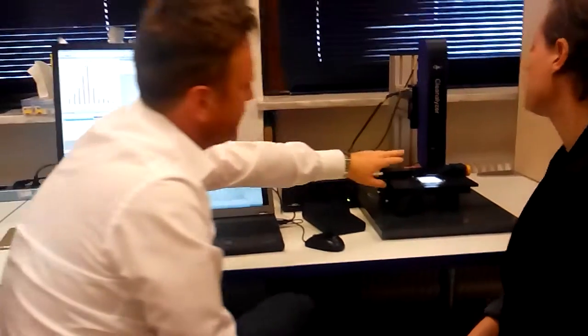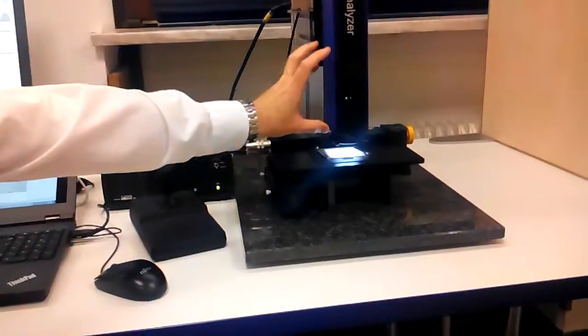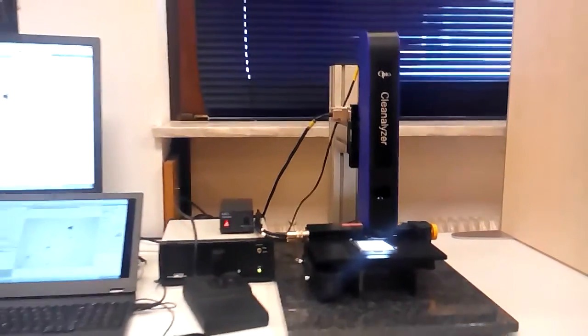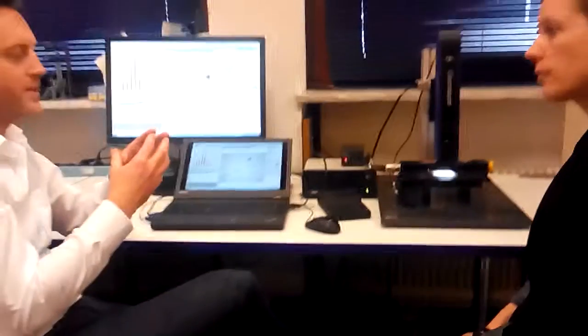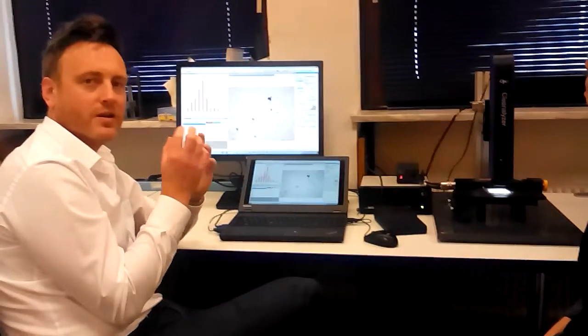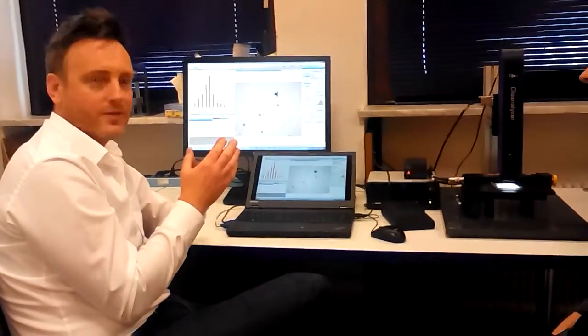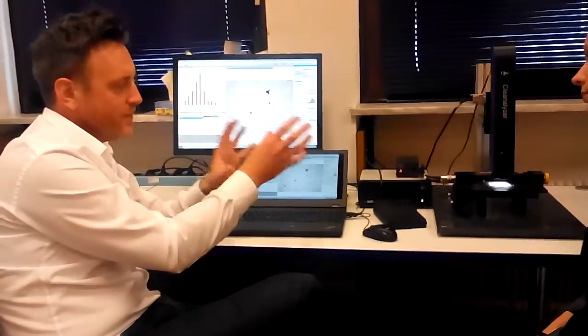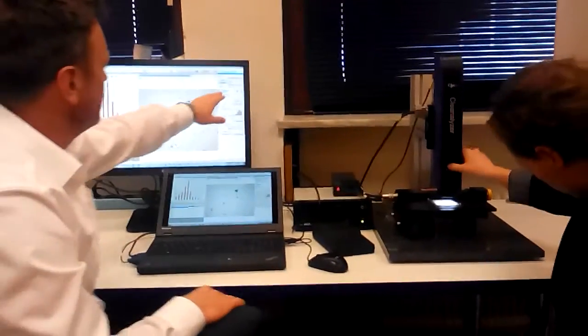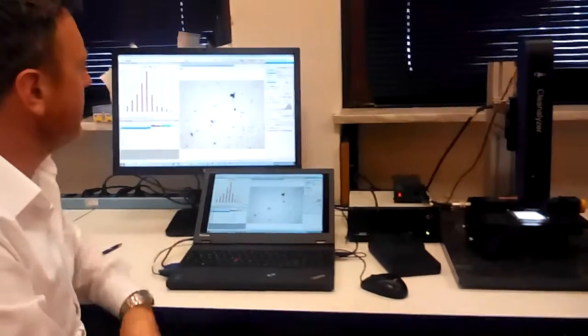So now on the front here, we have our magnification settings. Inside here I mentioned that there is a zoom system. This allows us to change the magnification of the system and to zoom optically, not digitally, if we wanted to get a much finer, much higher resolution to start imaging much smaller particles. Of course, as we increase our magnification here, our runtime increases. So we are running at 0.75 here. We've already inserted that into the system.